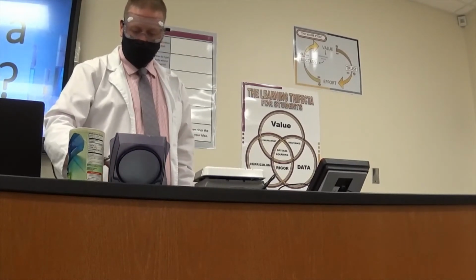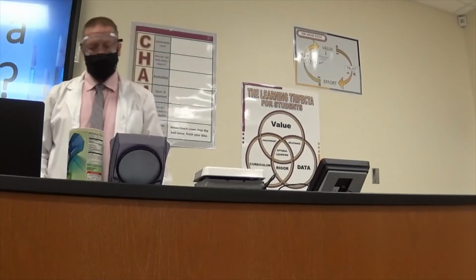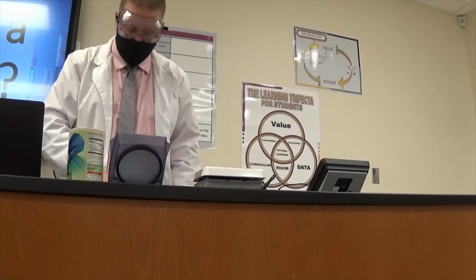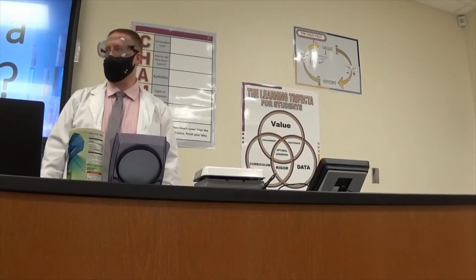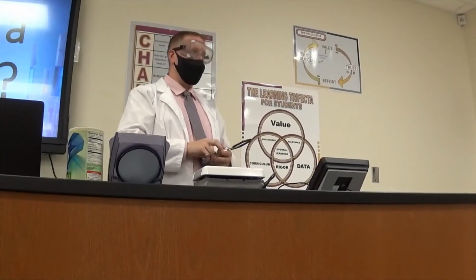And I put this on here. And again, it's a little bit above, so we must still have some water, but right now it's 114.66. Right? So all that water has evaporated and all the salt remains.